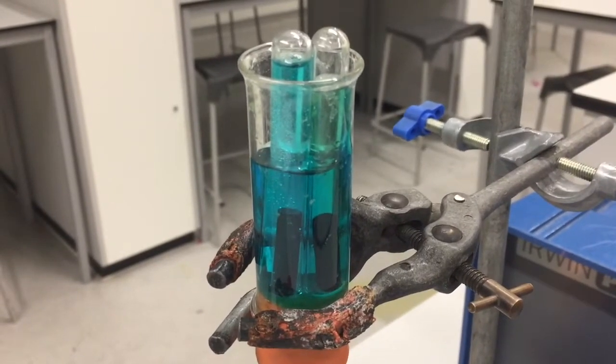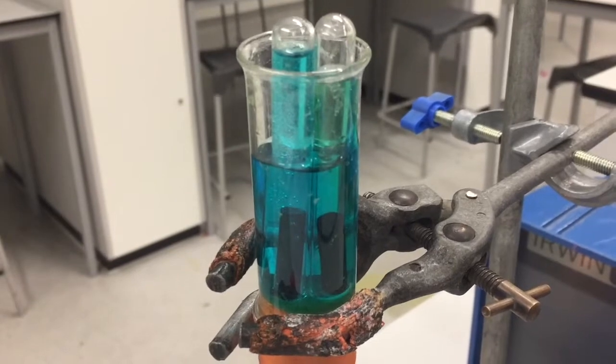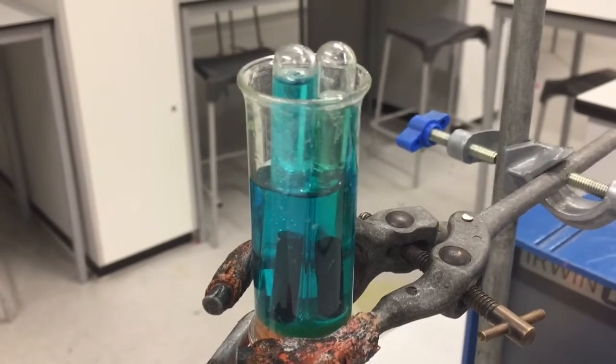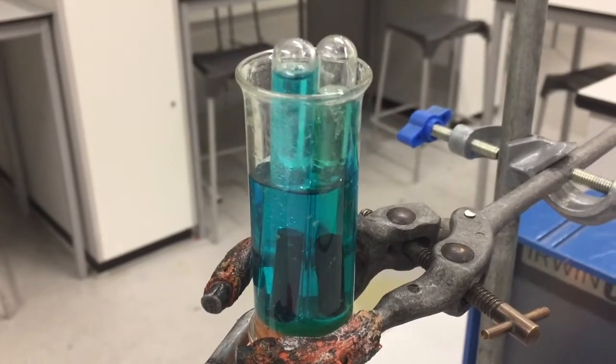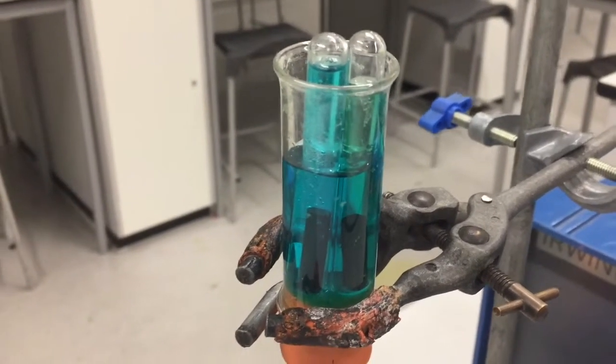Iodine and bromine will both form aqueous solutions but will discolour the water. You wouldn't want to make fluorine, it's very dangerous. So after a while of running this, we can get enough to test with a gas test. So we go to the second example, which is a bit more complicated.